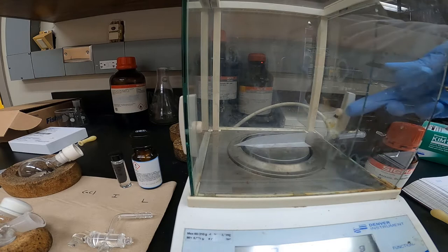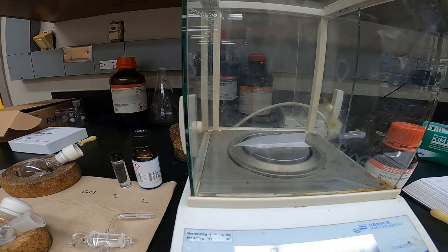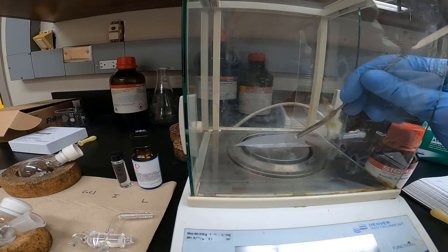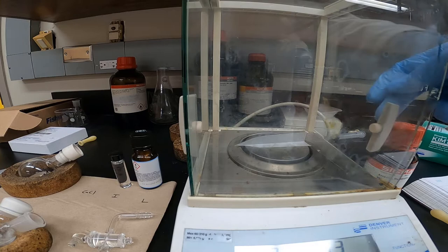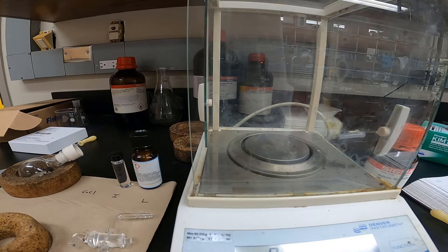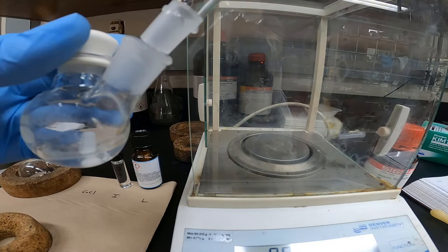The last reagent I'll add is the copper(I) chloride, which is a white solid. And just like the ligand, I'll add it to a piece of weigh paper and then transfer it to the reaction flask. And before I start the freeze-pump-thaw process, I'll add the gas flow adapter with some grease to seal the flask.